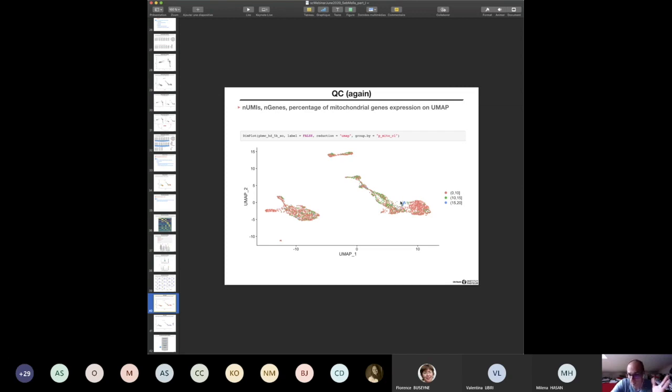If not, we can do an analysis keeping these cells and an analysis without them, and see what it gives in the end. In the end, what's important is the validation step, which I'm not talking about here, but it's obvious that everything we find by analyzing the data needs to be validated at the bench.